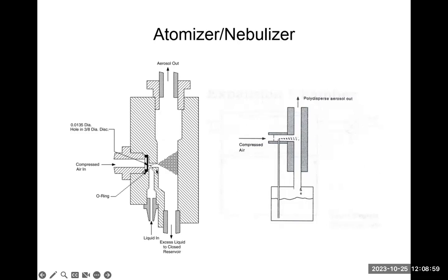And then whenever you have a high speed or high velocity gas stream, it's going to create somewhat like a Venturi effect that creates a low pressure zone at the side of the gas stream, right? And because of that, you can draw the liquid inside, and then the liquid will be brought by this relatively high speed gas stream, and further get impinged onto a solid surface.